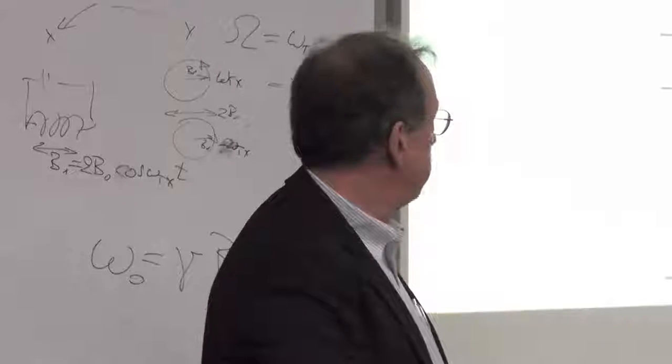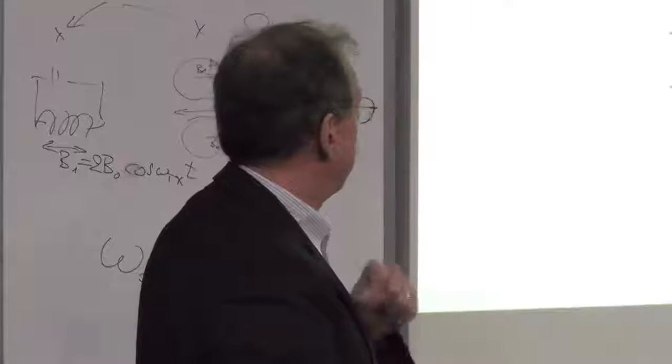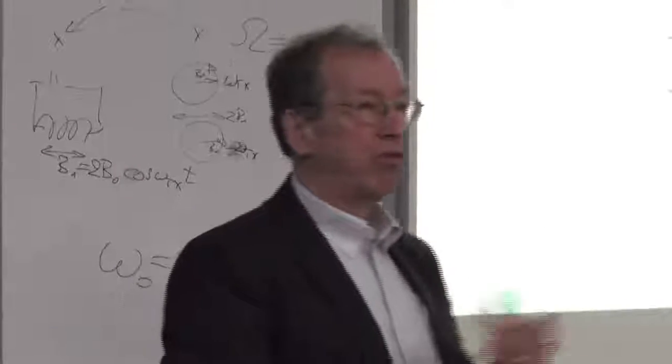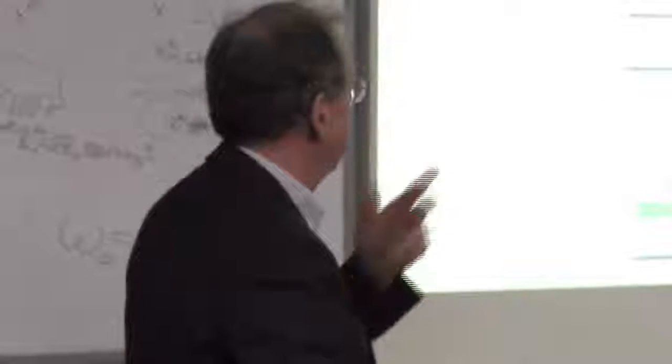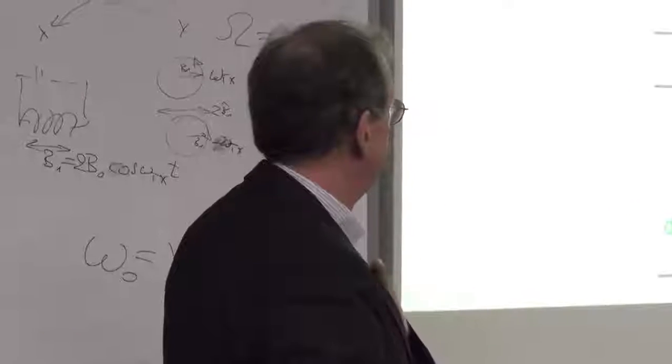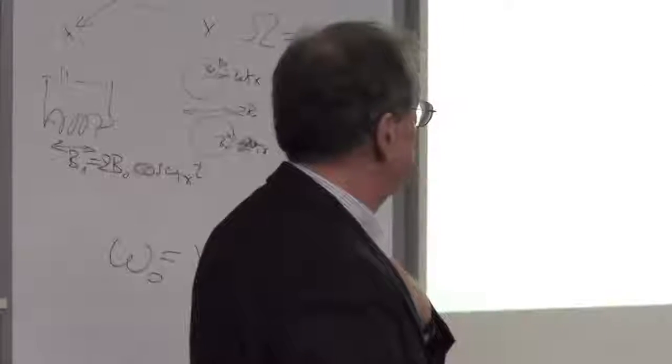And here I've given rough, very crude numbers of how strong these interactions are. The strongest interaction is the Zeeman interaction. This is for a 100 megahertz spectrometer. Hardly anybody uses it anymore today. The chemical shift, an old-fashioned one, maybe 10 kilohertz, depends on field strength and nucleus. Radio frequency excitation, 100 kilohertz, a pretty strong radio frequency field.